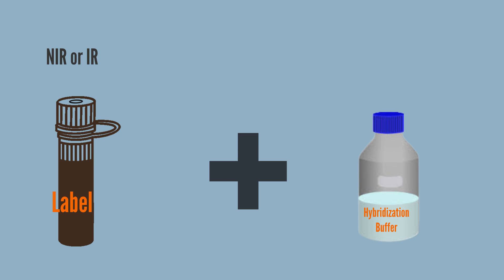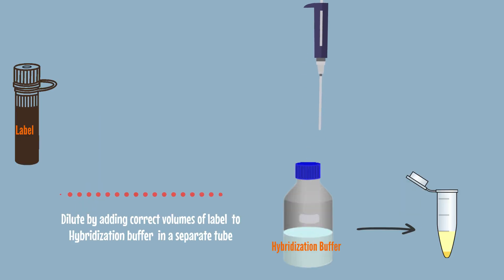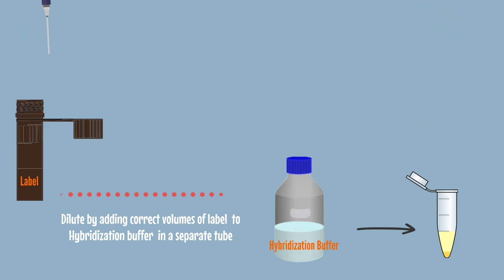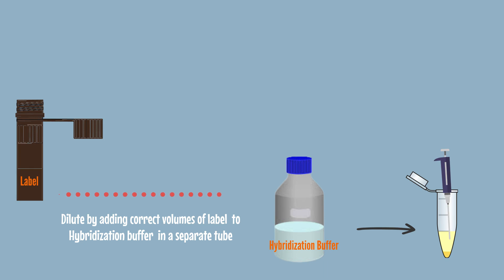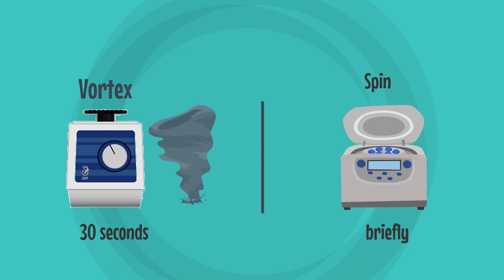Note the location of Stellar Detection preps and reagents. You will need an NIR or IR Label and Hybridization Buffer. Mix by adding correct volumes of label to hybridization buffer in a separate tube. Vortex for 30 seconds and spin briefly.